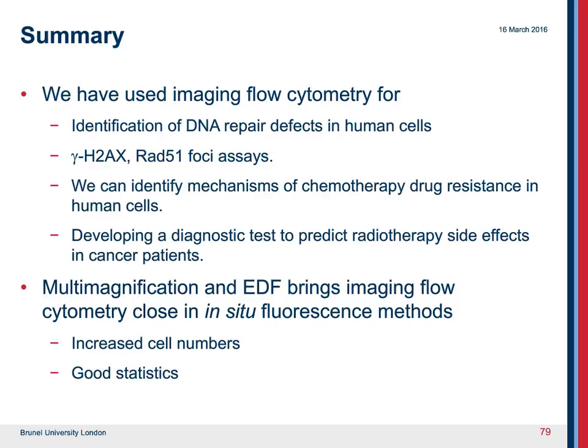And we would also add that the multimagnification and the extended depth of field brings imaging flow cytometry close to in situ methods. The advantage is that you get near the same number of foci identified, but you can count many more thousands of cells. So that gives you good statistics.